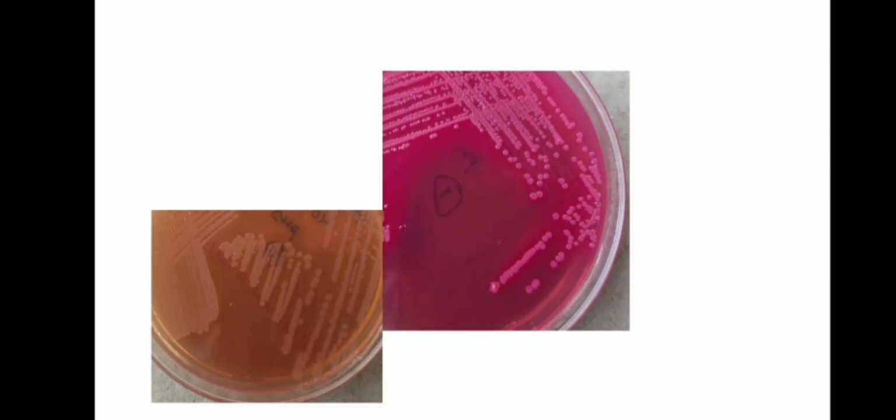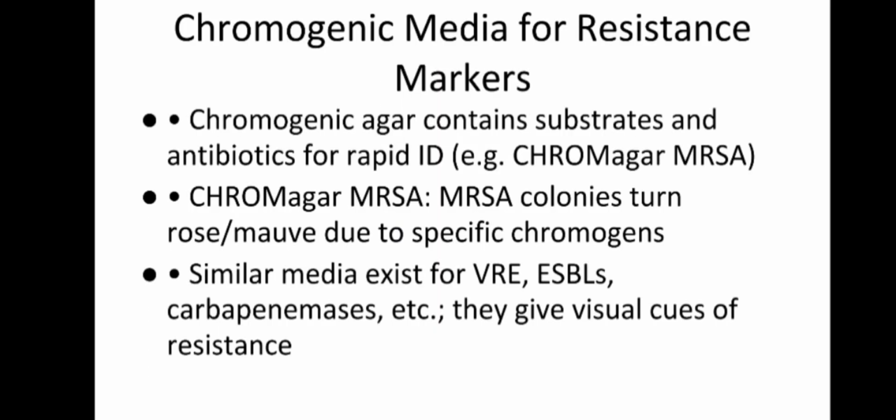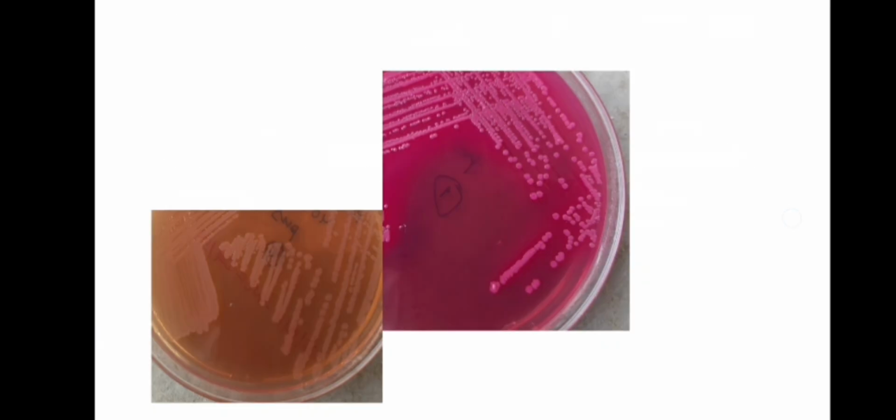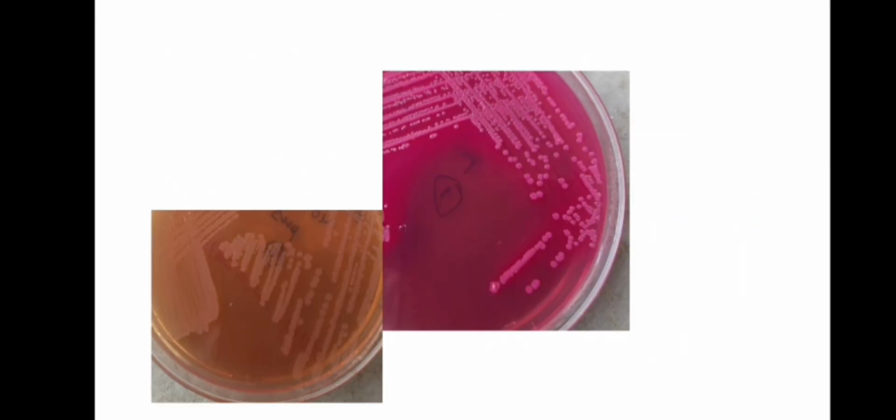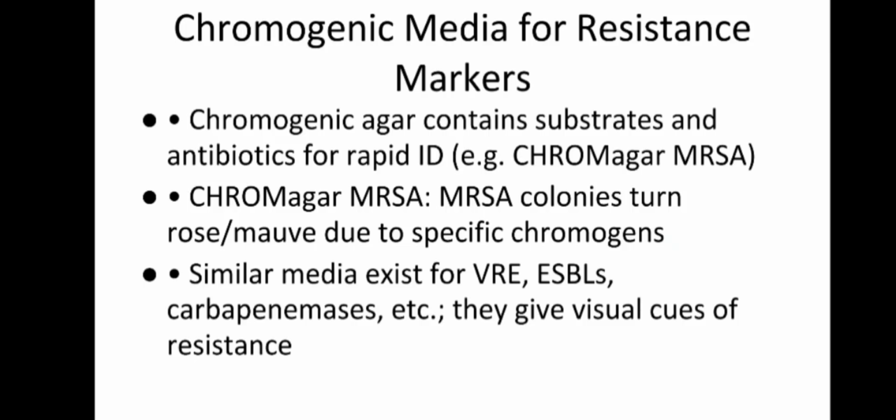Then using this colony you further culture them, and we will further do the testing if interested. Otherwise we'll just report the differential. So chromogenic media for resistance markers. Chromogenic agar contains substrates and antibiotics for rapid ID.